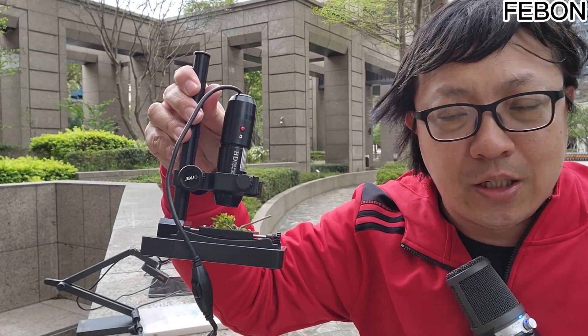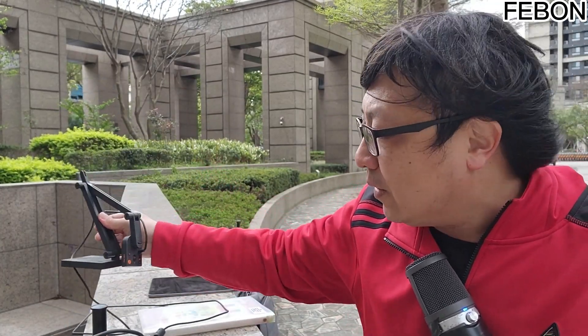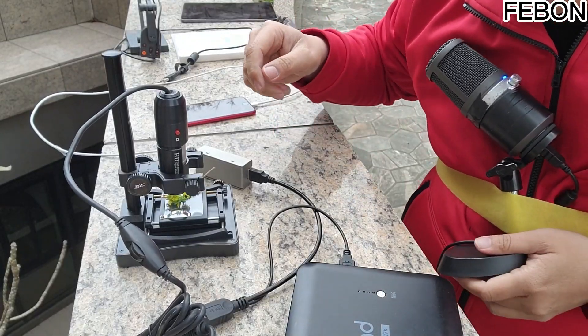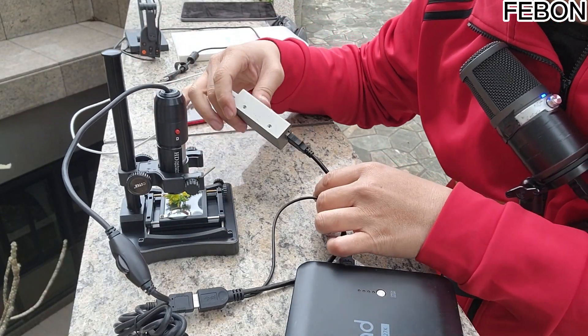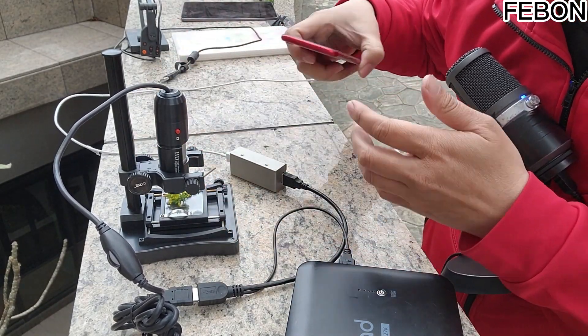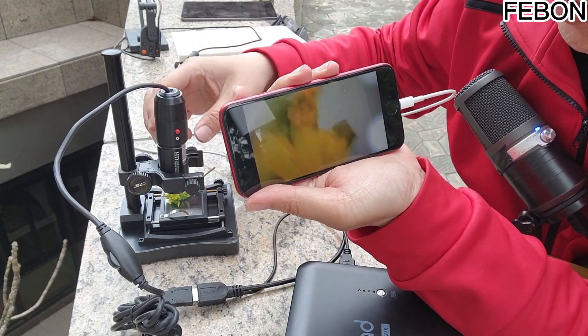That is how to use this USB microscope or this kind of document camera — actually on your mobile phone or on your iPad when you are teaching outdoors, without connecting to a computer. See, what you are seeing now is a USB microscope. It is showing a flower on this side, and I can see it on this iPhone. This is a flower we saw.